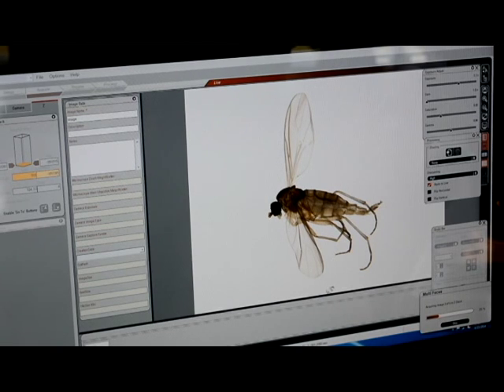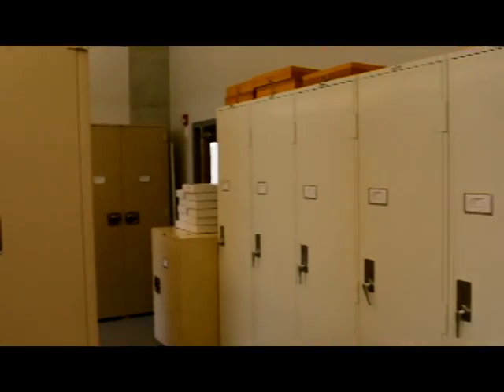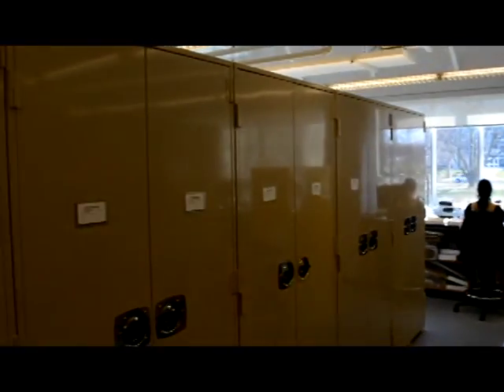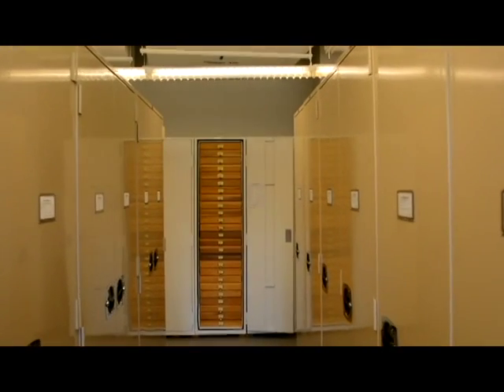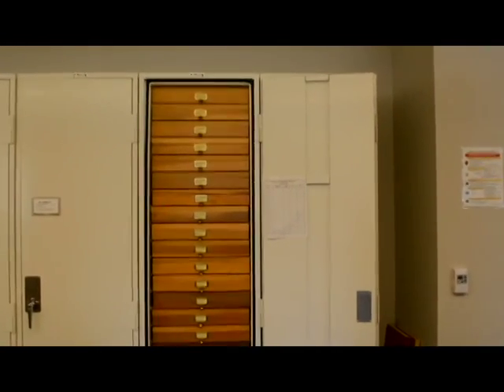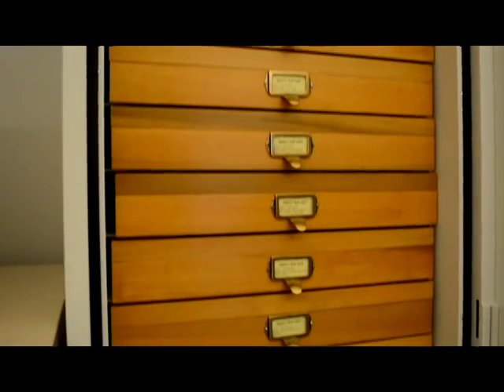All the specimens that you collected will find a final resting place in our storage facilities. In this collection, we can house about 1 million insect specimens for a very long time. Every barcoded animal is stored in such a collection, for example in a museum or at our institute. Most of the insects will be pinned and sorted into a box, which together with a few other boxes will go into a drawer in one of the cabinets shown here.